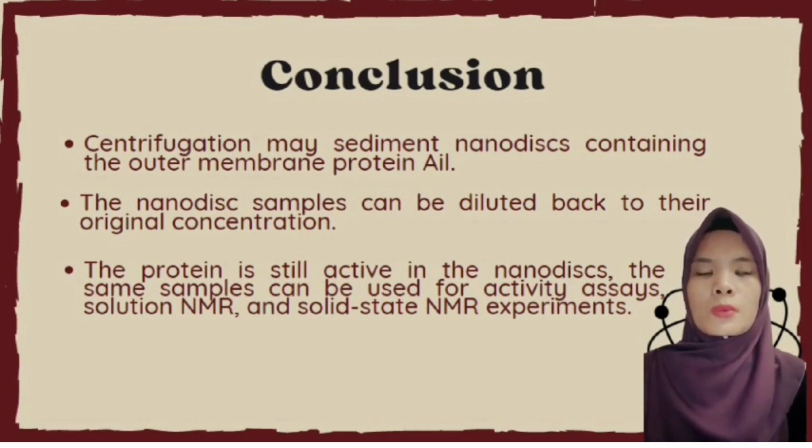Additionally, since the protein is still active in the nanodisc, the same samples can be used for activity assays, solution NMR, and solid-state NMR experiments. This makes it easier to investigate the structure and activity properties across a variety of dynamic timescales without the need to lyophilize the sample or add potentially harmful detergents or precipitants.